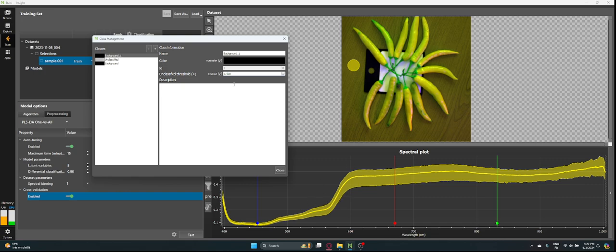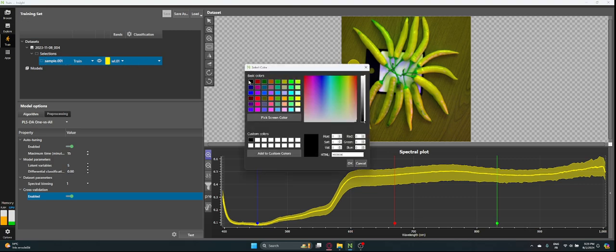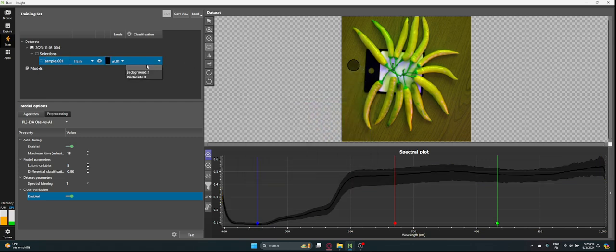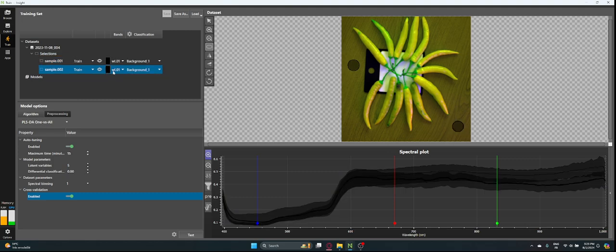But the problem is that the higher you put it, the more similarity there will be, and one mistake and you are going to select everything as a background. So I can use this as a background, which I select as black. Then I can use another one. I'm just going to do the same thing, background validation.